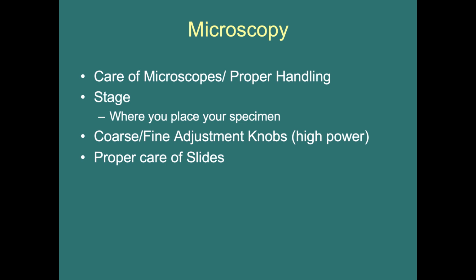So a lot of this will be review, and we're not going to spend a whole lot of time on this. But we wanted to just make sure that you are taking care of the microscopes, and you're handling them safely and carefully. We want to make sure you know where to put your specimen on the stage. And we want to just point out the coarse and fine adjustment knobs, because this sometimes gets reversed with students using these microscopes. And then last, just our proper care of slides.